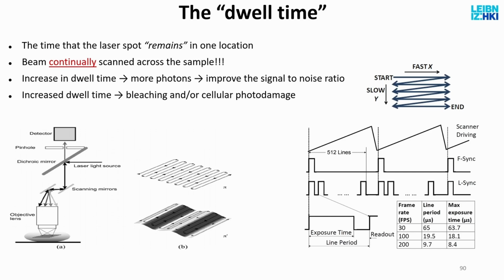And this guy told me he wants the pixel size to be 100 nanometers. And he told me to scan 500 micrometers or 100 micrometers sample size. Now I can calculate how long I have to collect light for 1 pixel. And then when you look at the software, it says optimal pixel time.